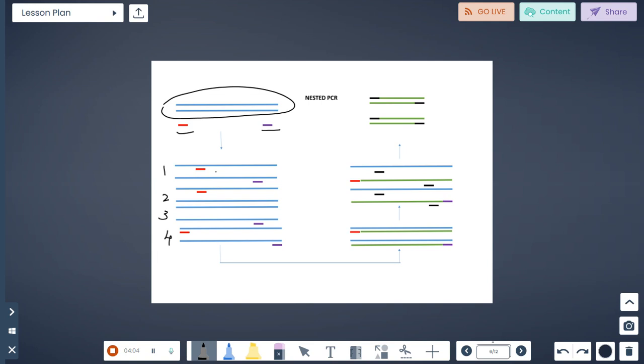In some situations, the primer and template will have perfect base complementarity, and it will bind to the exact place. And sometimes the primer will have slight base pairing with some other region of the template, so it will be binding with some other region, like this. Sometimes to one template only one forward primer will bind, or only a reverse primer will bind, so the primer and template will be binding at different locations, like that.